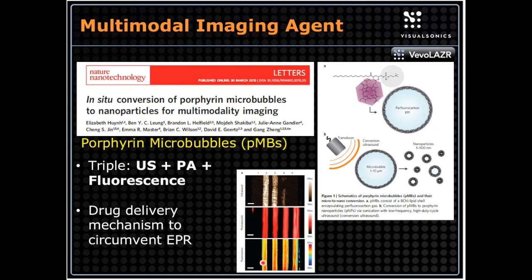and fluorescence. The implications of that are many, one being this could be a potential drug delivery mechanism, and you could actually image how much of that drug is being delivered based on maybe the decay of the ultrasound signal or the increase in the photoacoustic signal as you convert these things to nanoparticles, where they're small enough, basically, that they'll be able to escape the vasculature.